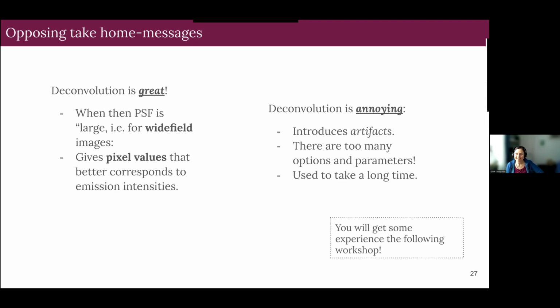Good, thank you. We've seen lots of quite impressive images. So before we move on to the other Zoom, I want to know if there are some questions about the lectures. Has anyone tried deconvolution before? Anna-Marie, yeah, Alejandro? Yes. Peru works with STED, so good. Yeah, but actually I did deconvolution on Airyscan, not with STED. Right, yes, that's also part of the Airyscan process.